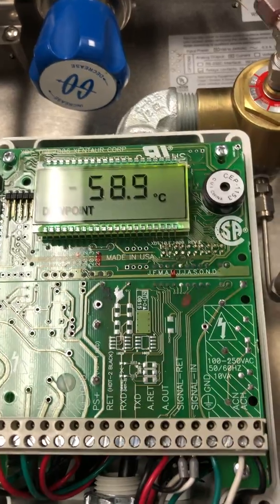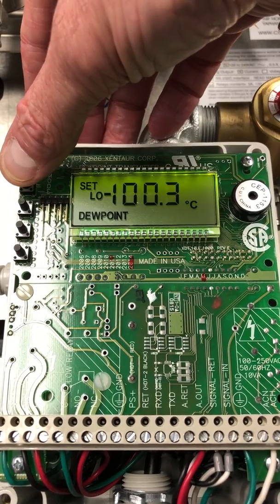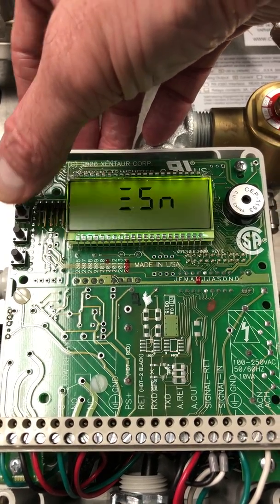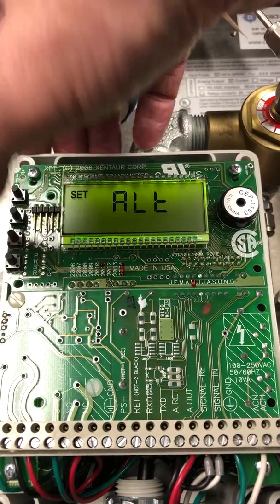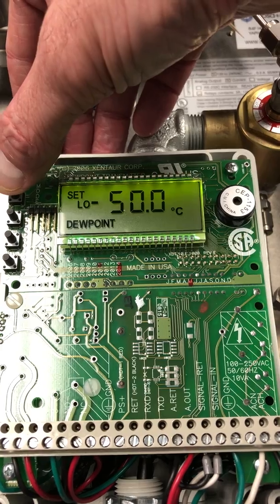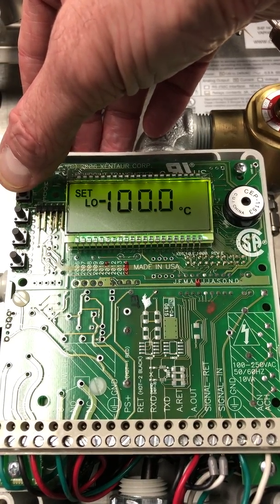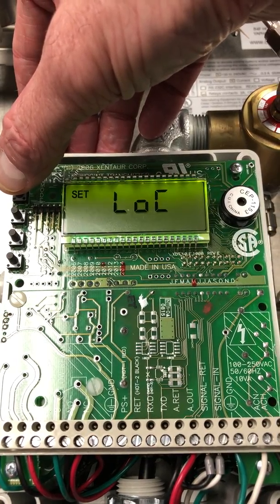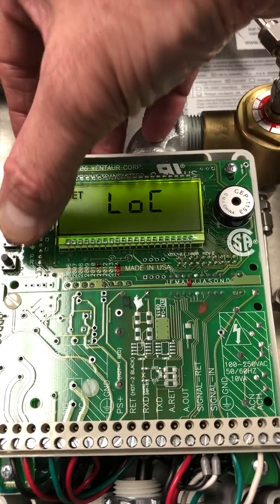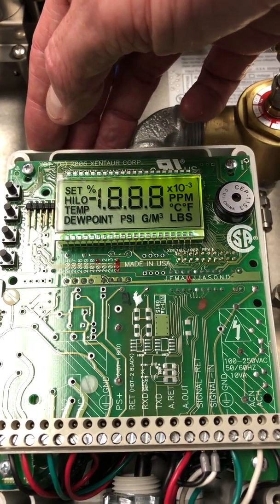But first we have to unlock the unit. Press the first button, navigate down to the serial number, then hit the last button — that takes us to the alternating display. Go down to unlock, hit the second button to unlock, then the fourth button which restarts us.